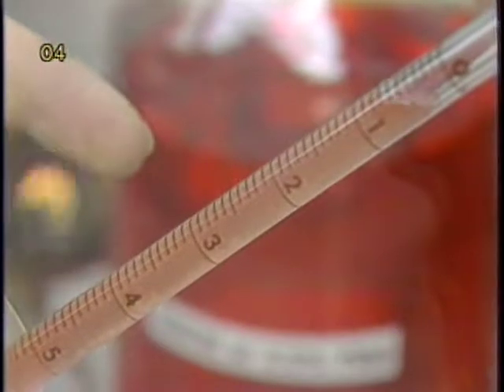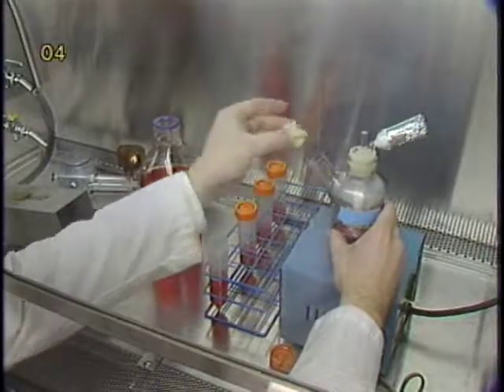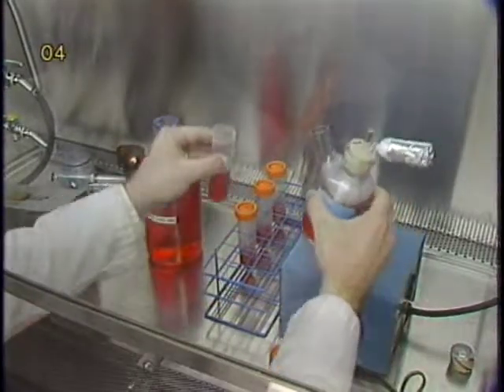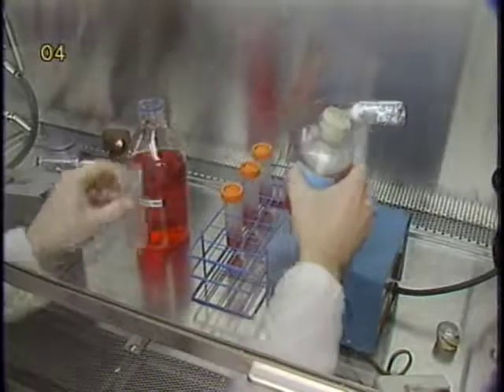The cell suspension is gently dispersed again to ensure that the cells are in single cell suspension. The cell suspension can then be poured into the spinner flasks while the microcarriers are in suspension. This process has to be done as quickly as possible to avoid changes in temperature and pH.